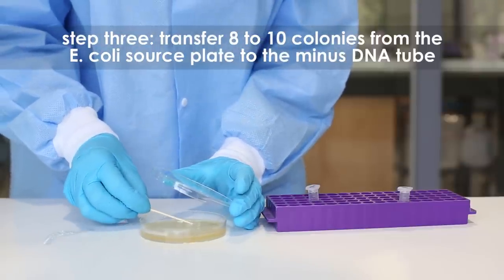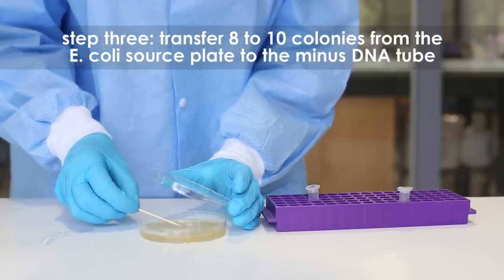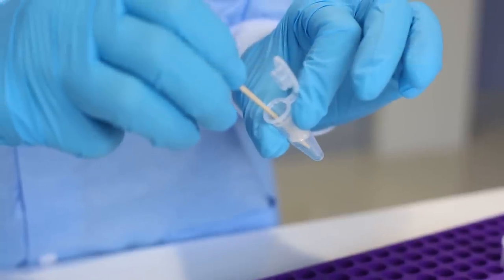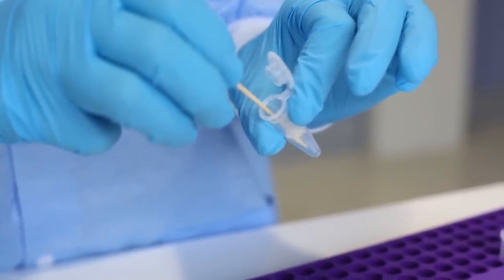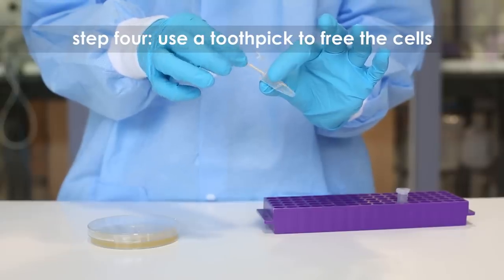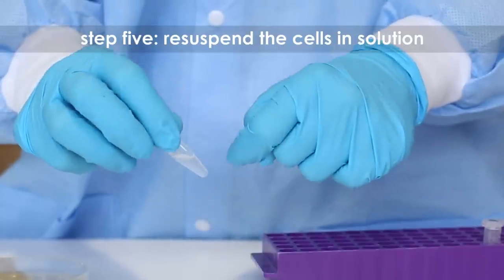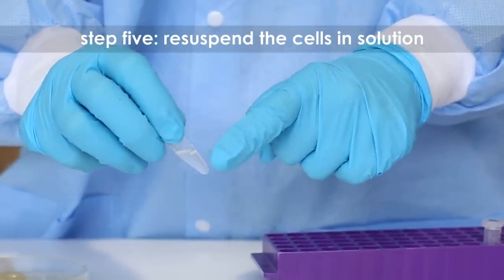transfer 8 to 10 well-isolated colonies from the E. coli source plate to the minus DNA tube. Step four: vigorously twist the toothpick between your fingers to free the cells.